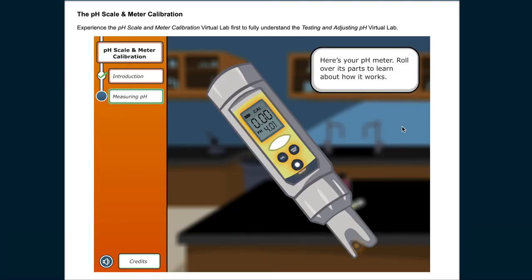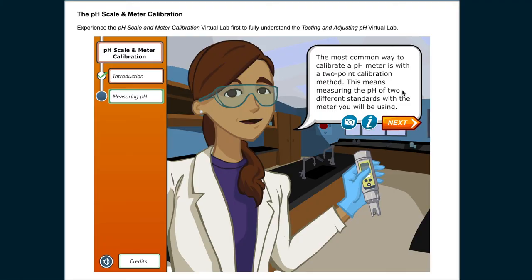Here's your pH meter. The most common way to calibrate a pH meter is with a two-point calibration method. This means measuring the pH of two different standards with the meter you'll be using.